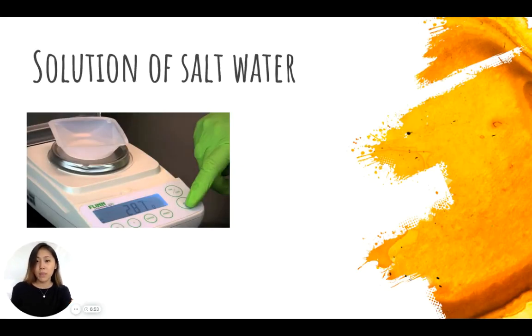Similarly, let's say we were trying to make a solution of salt water. So we needed to measure some salt using an electronic mass balance, measuring 2.87 grams of salt. This gives us a value of up until the accuracy of the hundredths. So this means my uncertainty would have to go to the hundredths. So I set it as plus or minus 0.02 because I feel like the electronic balance is probably pretty accurate. So I'm not going to make it greater than 0.02 grams for my uncertainty.